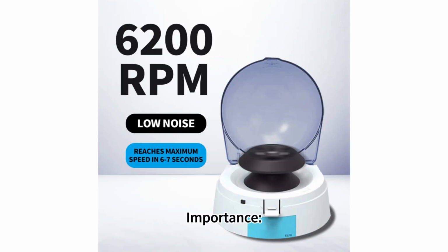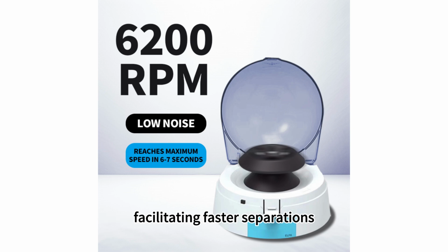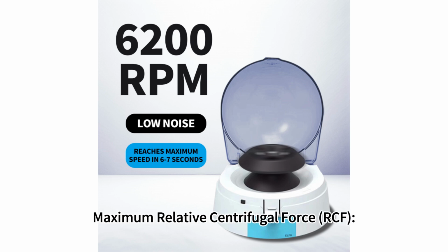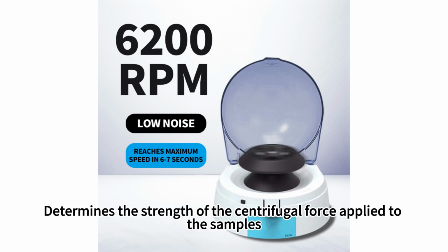2. Importance: Higher speeds generate greater centrifugal force, facilitating faster separations. Maximum relative centrifugal force, RCF. 1. Measured in G-force, gravitational force. 2. Importance: Determines the strength of the centrifugal force applied to the samples.